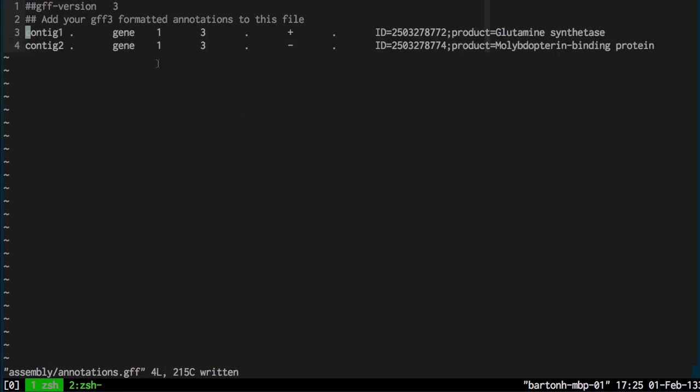So I've just added two annotations. If you're not familiar with GFF3 format, it's the source sequence, the type of annotation, the start position, the end position, the strand, the ID, and then the product. And so I've got a glutamine synthesase on contig one and a molybdopterin binding protein on contig two. And these are just examples because obviously you're not going to see very many three nucleotide long proteins.